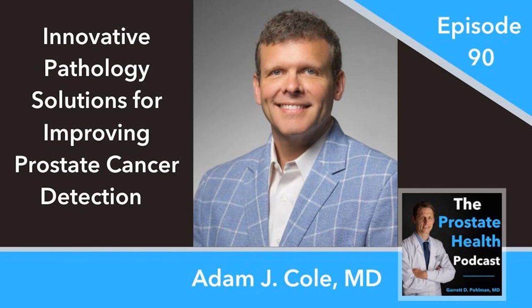But another significant reason for false negative results can be, as you mentioned, tissue loss due to poor orientation and fragmentation of the tissue. Could you expand on this, including how does tissue handling actually negatively affect the ability to detect prostate cancer and the solution that TruCore Pathology is utilizing to help prevent this from happening?